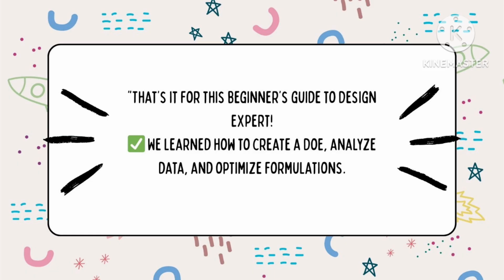That's it for the beginner's guide to Design Expert. We learned how to create a DoE, analyze the data and optimize the formulation.